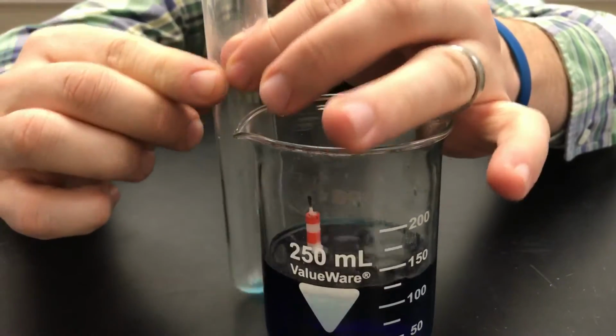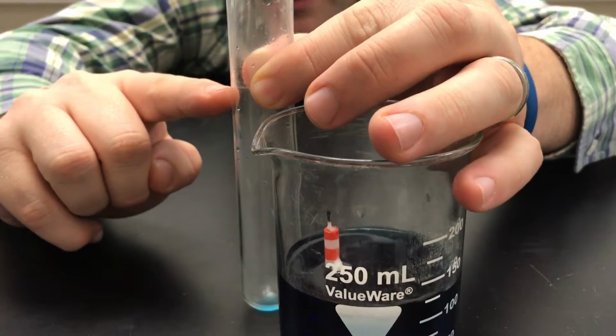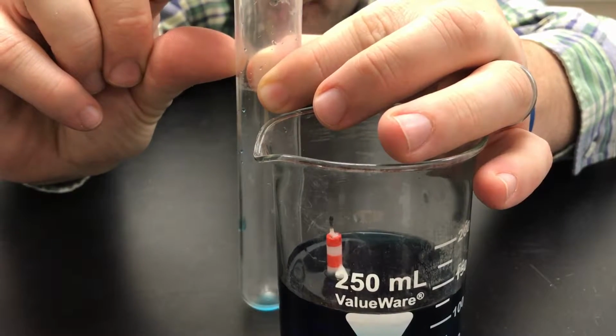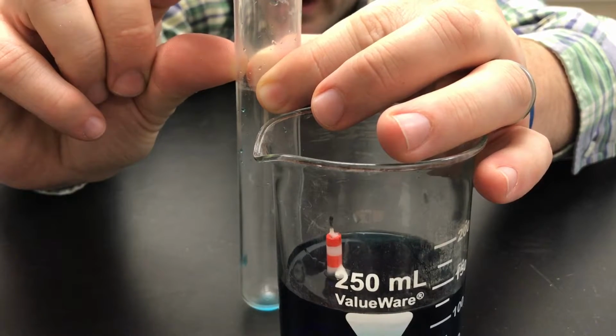So this part of the test tube represents parts of the air that were not oxygen and were not consumed by the flame. This volume of the test tube represents the part of the air that was oxygen in the air.